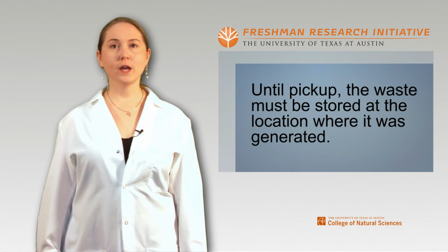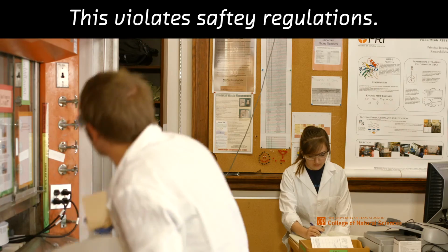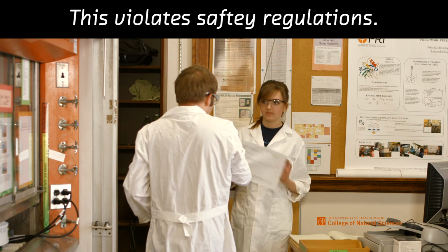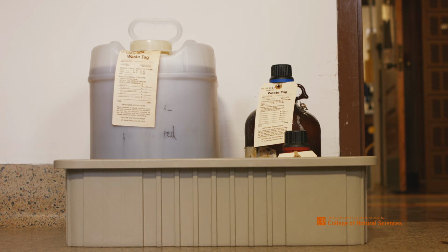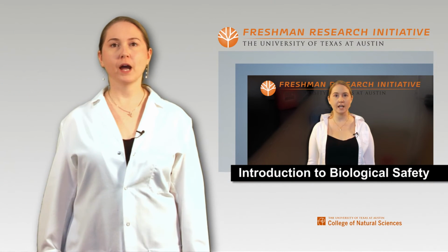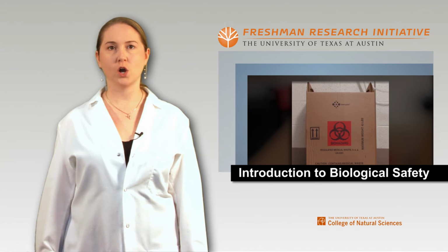Until pickup, the waste must be stored at the location where it was generated. Waste must never be transported to another room for pickup. This violates safety regulations, and the laboratory generating the waste can be cited for doing this. Liquid waste stored on a lab floor must always be in a plastic secondary container. Preparing biological waste and sharps for pickup is covered in the Introduction to Biological Safety video.